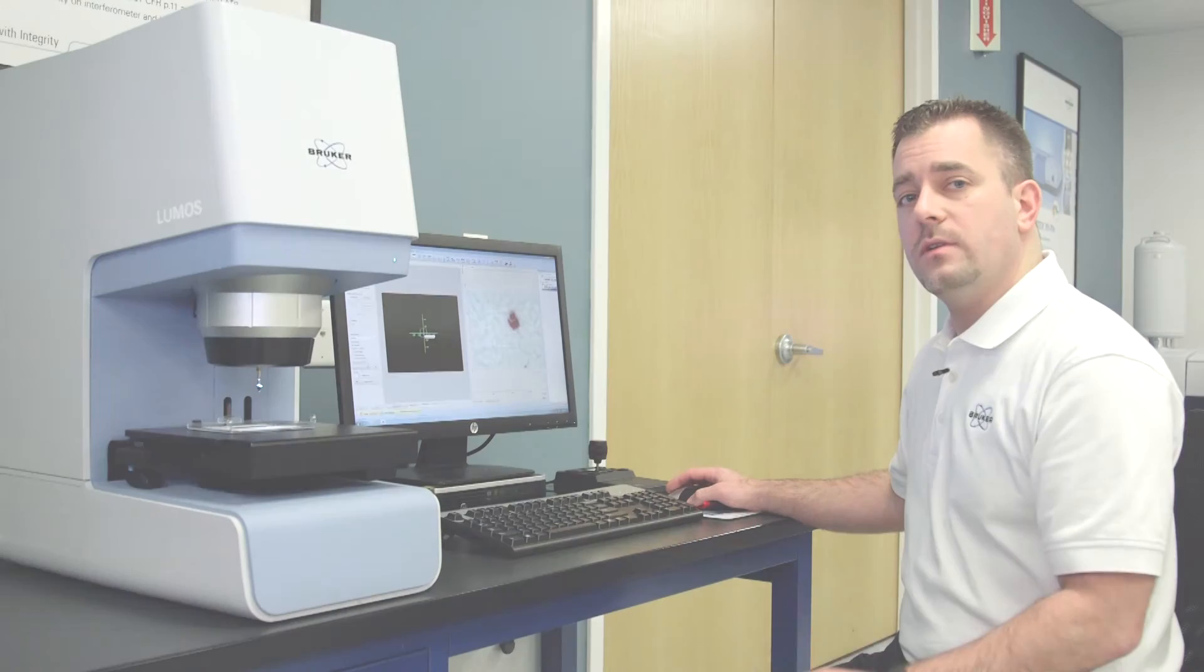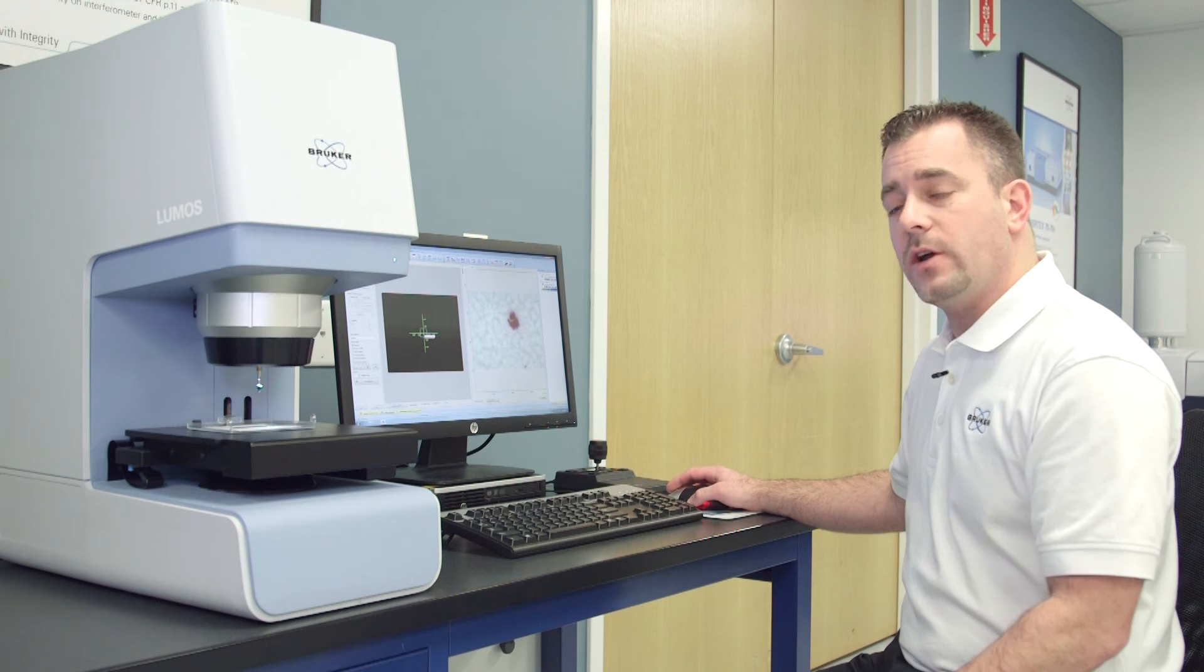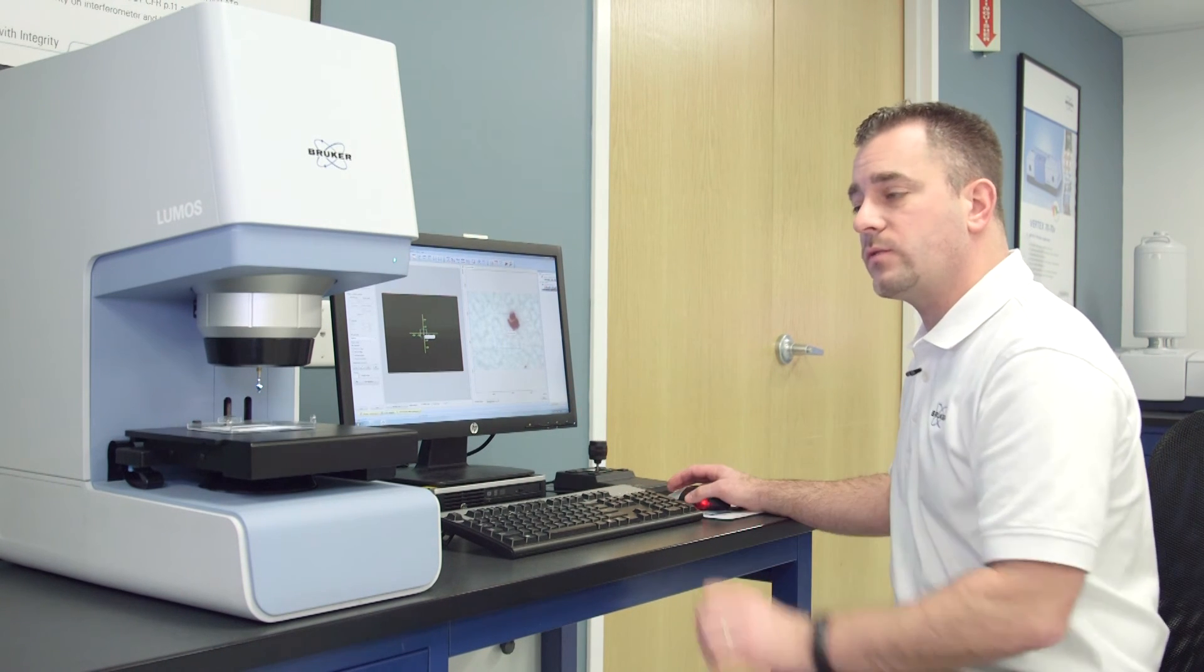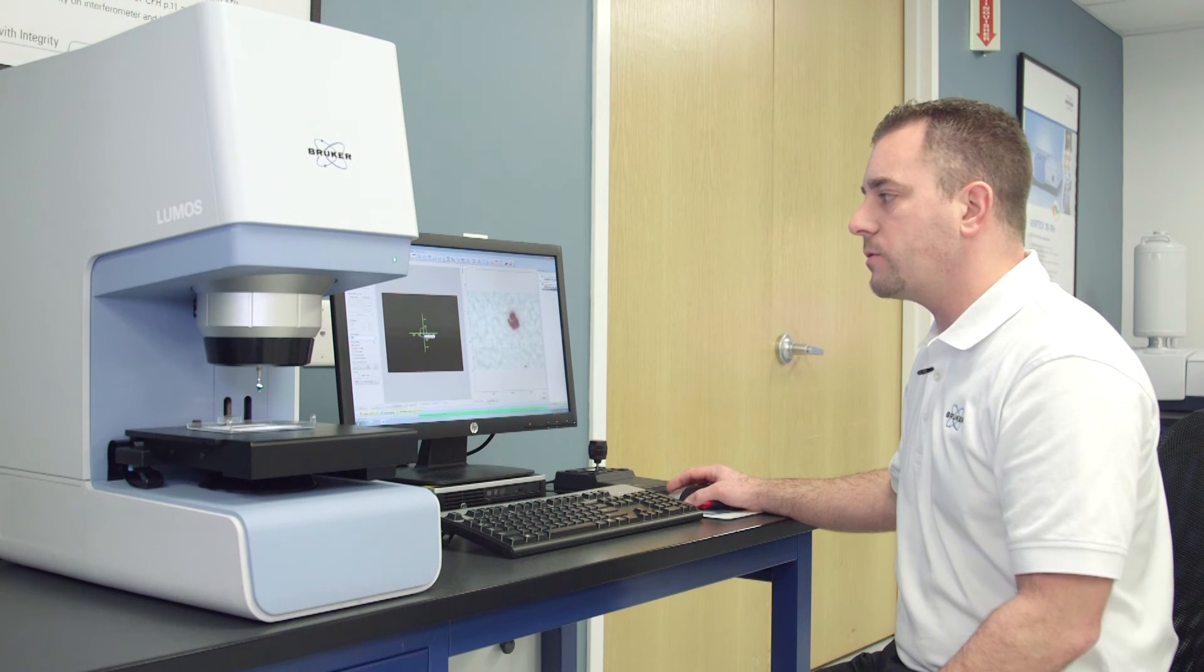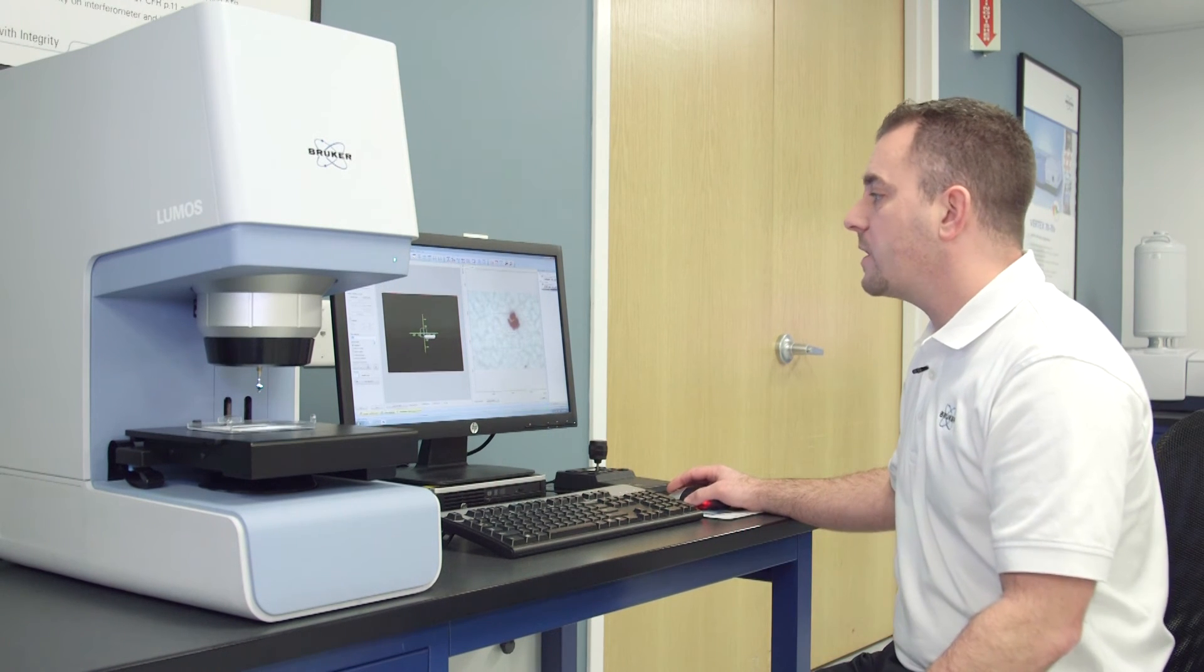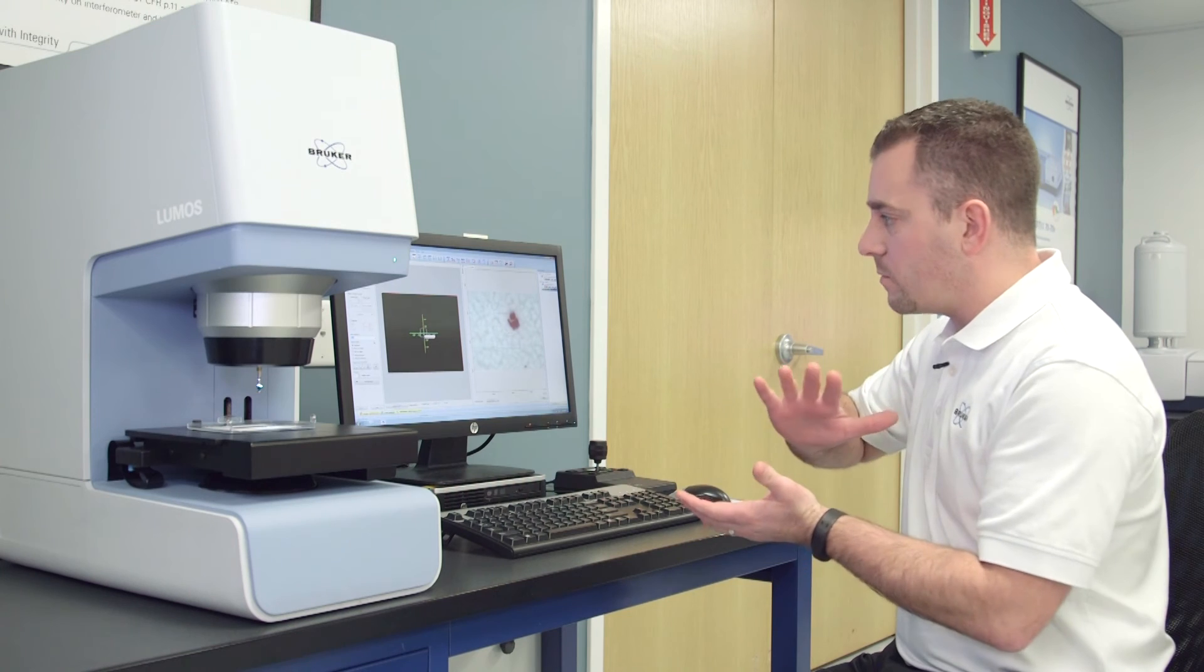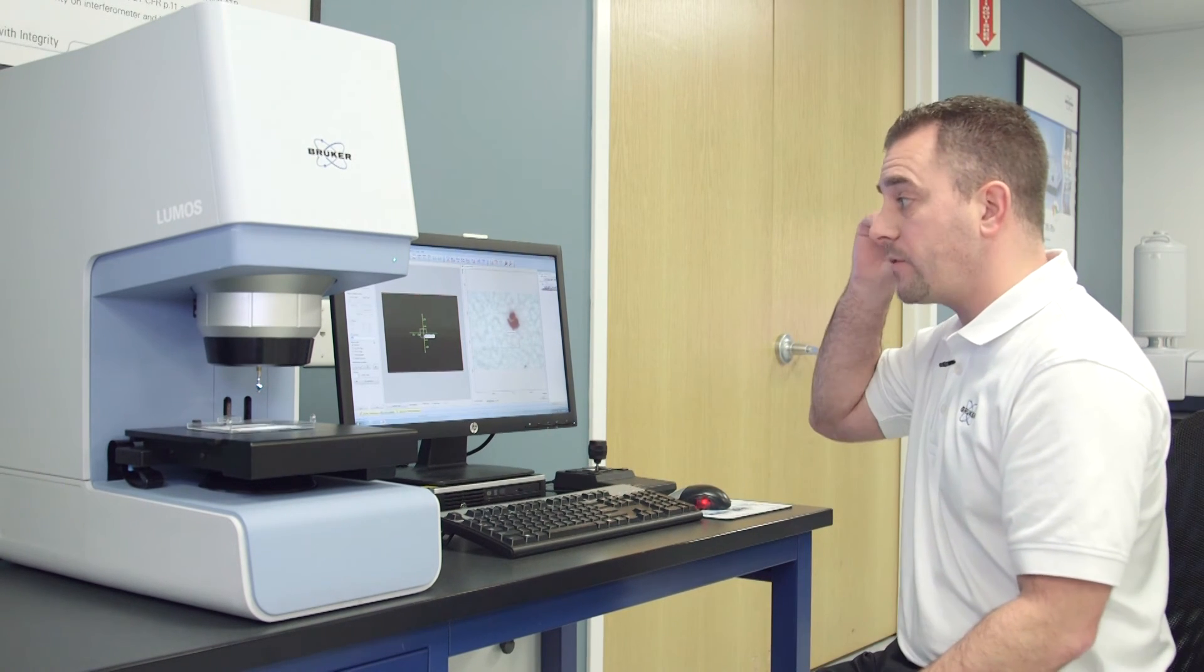Here I can choose the pressure settings I use from my ATR. Now my ATR objective itself in the post has three built-in pressure sensors: low, medium and high. I typically start with low just to protect my sample. If I need better contact or more pressure on the sample I'll choose medium or high afterwards.